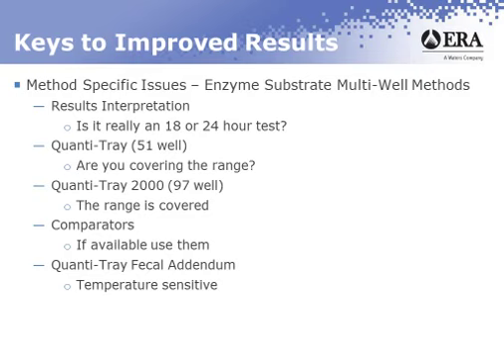One thing that we've seen is that you need to be really careful when you're doing this because it's very sensitive to temperature. You want to make sure that, in our opinion, you're ideally using a water bath, but definitely maintaining the temperature tolerance prescribed in the method of plus or minus 0.2. If you get outside of that, it's very possible that you can cook the organisms and they will not grow. One way to help you to avoid cooking the bugs is, if you're using a water bath, use a circulating bath. Keep the trays off the bottom or off the walls.